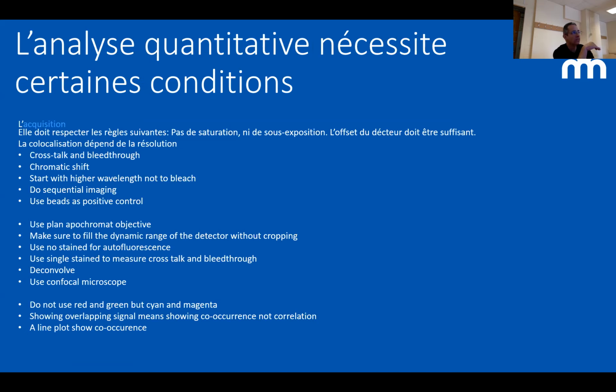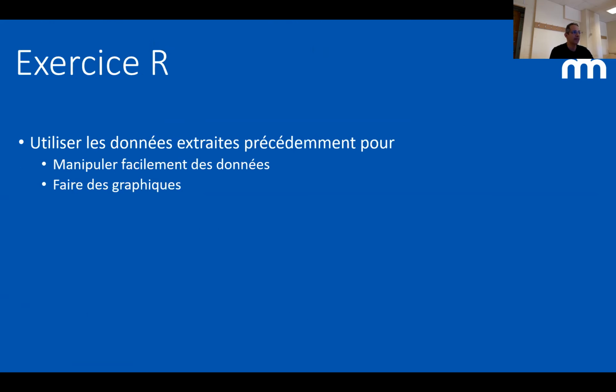These are all the things you should check when you are doing a quantitative analysis. I didn't want to go into the details of that because I think it's too long for today, so I put this on the side. And then I put an exercise because I think it's important you learn to do statistics using a tool that is powerful and easy to manipulate data and make graphics. So I wrote some exercises to do in R.